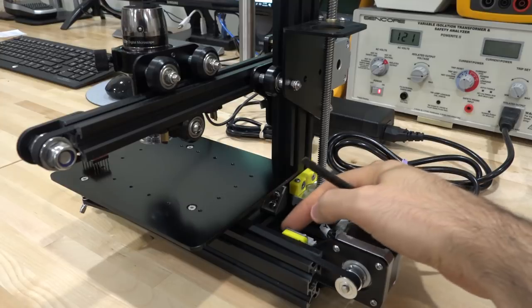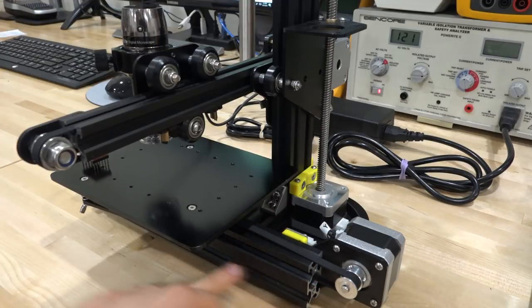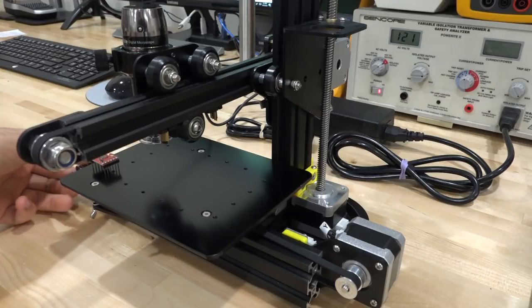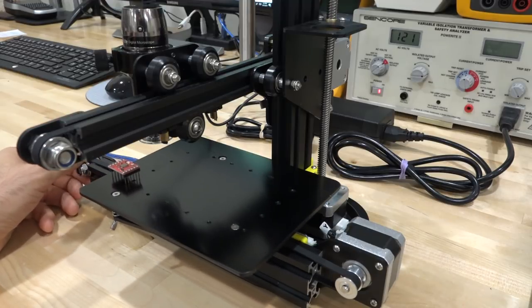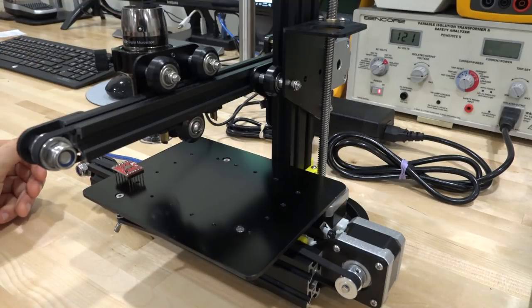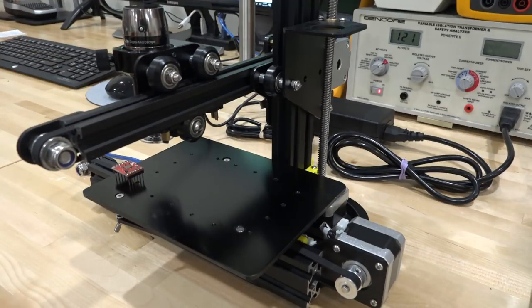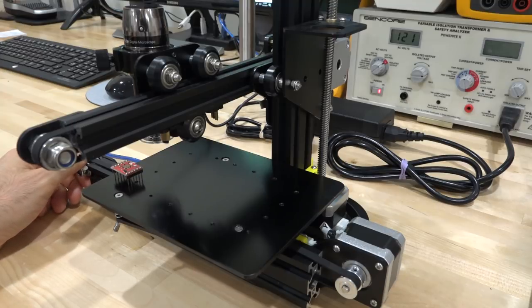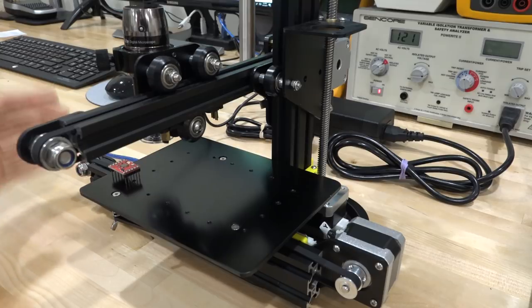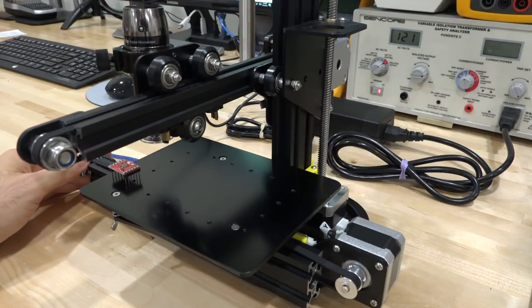There are a couple of switches at the very end — one is used to zero out the units. When you turn it on, it will move the platform until the switch is activated, and then it knows how many steps it takes to move the platform all the way to the end. Unfortunately, there is no switch on the other end, so it relies on counting steps to make sure you don't crash the platform. It seems to be working fairly well, though I wish it had a switch at the other end — dual protection is always a good thing. This unit uses a COM port to move the platform around, and I think it might be fairly well hackable. You could even dual-purpose it — put a laser engraver or something else in there to make some kind of automated system. We love that type of hackable system.